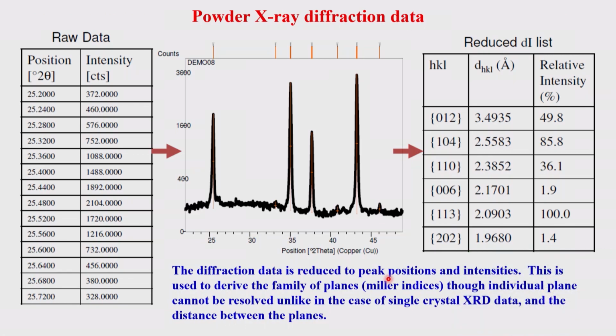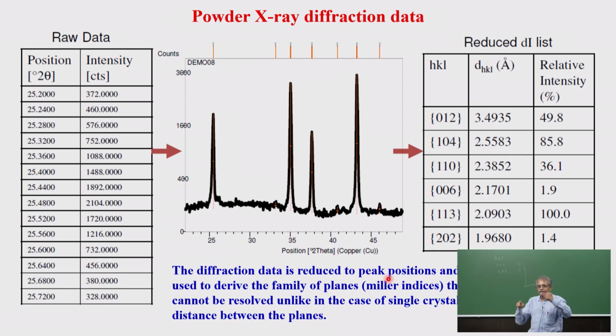Now overall we have looked at how a diffractogram comes like a cone, and when you open the cone it becomes a strip with 2 holes in it, because one is the input radiation and the other is the exit radiation. But now you don't use that at all. You use the diffractometer completely, to measure the radiation with a detector straight away without using any kind of films.